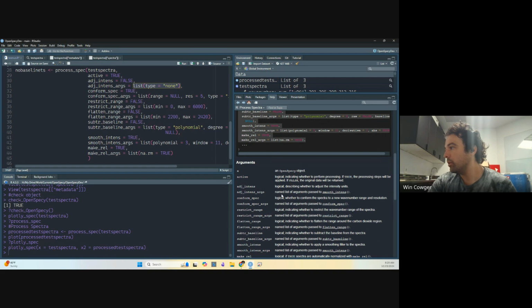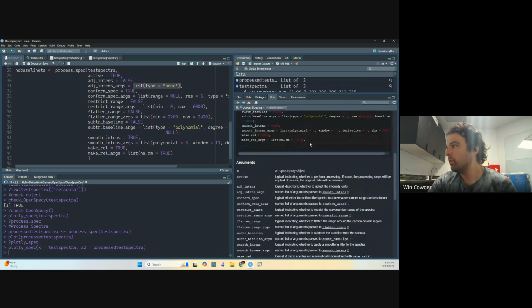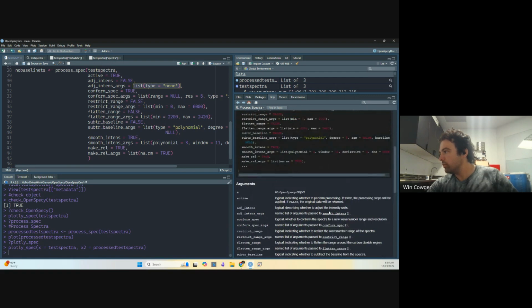What's the name of the arguments? Let's see here. Oh, that one's incorrectly labeled. One sec, let me.